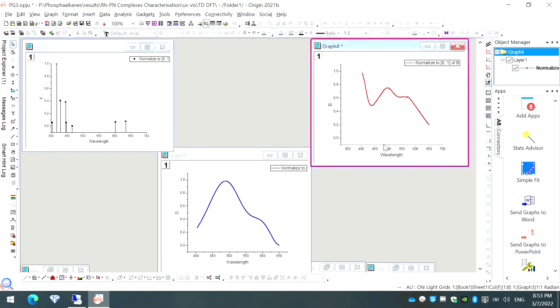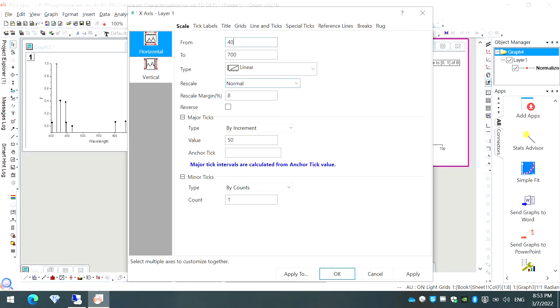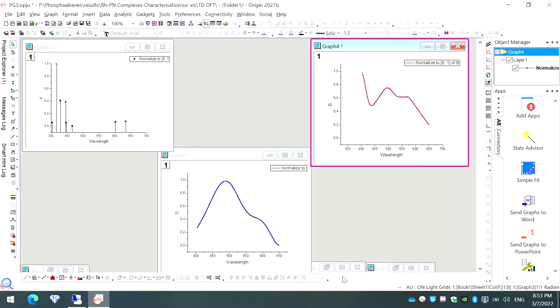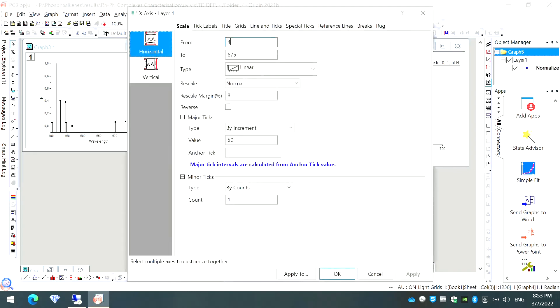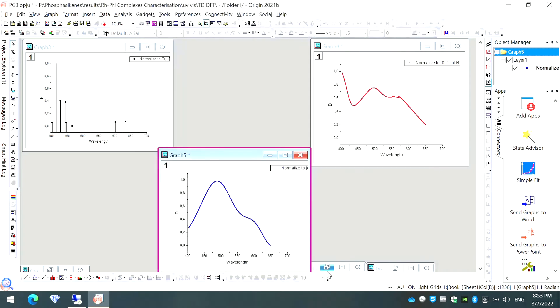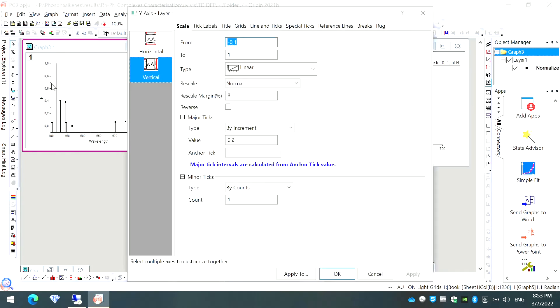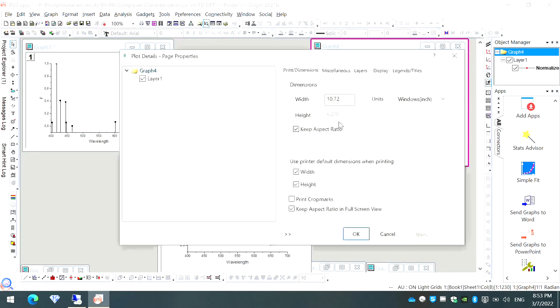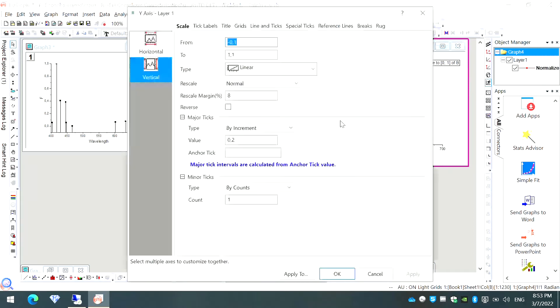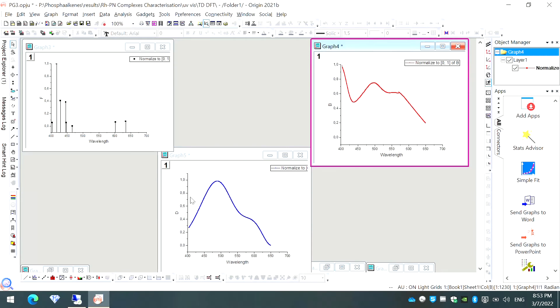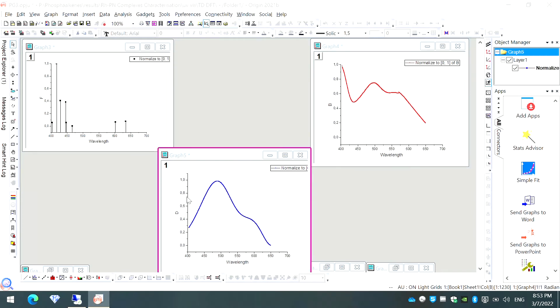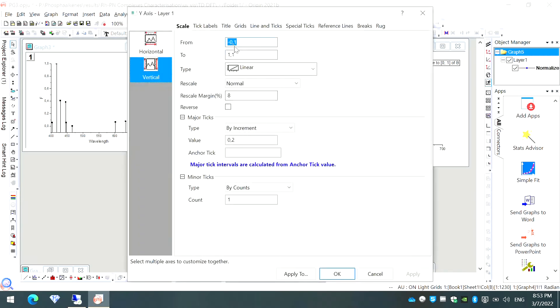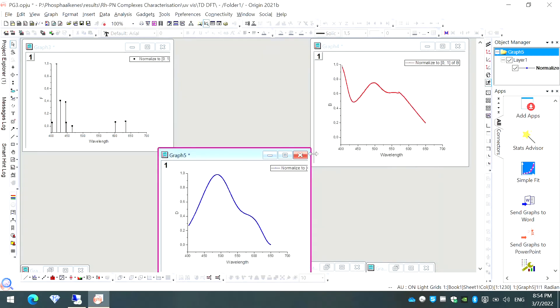We will do the same procedure for all of these, 400 to 700 with an increment value of 50. So I will make it same for all my plots. We have made the scale of X axis similar for all my graphs. Now I will quickly check if the Y axis scale is same or not. It is from minus 0.1 to 1 with an increment value of 0.2. Here it is to 1.1. I can change this one also to 1 with an increment value of 0.2. Similarly for my graph number 5 also, I'll change it to 1 with an increment value of 0.2.